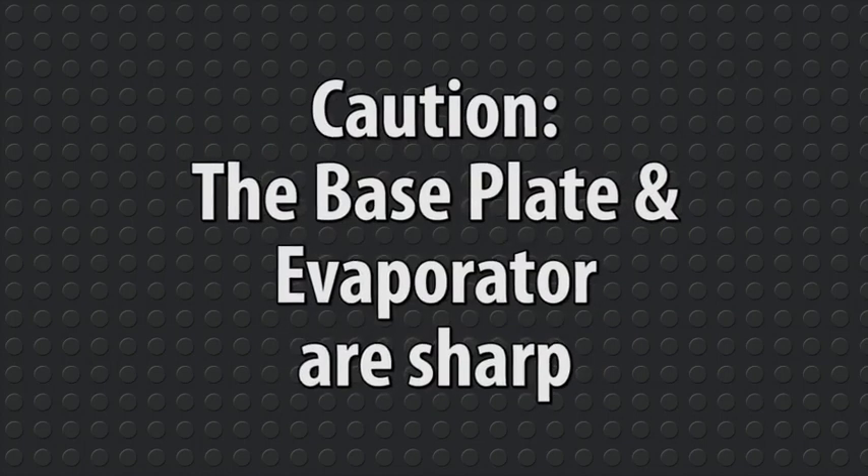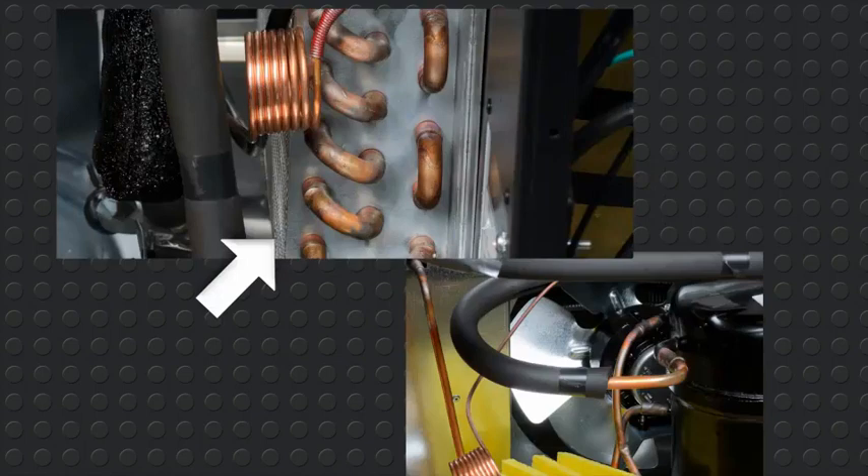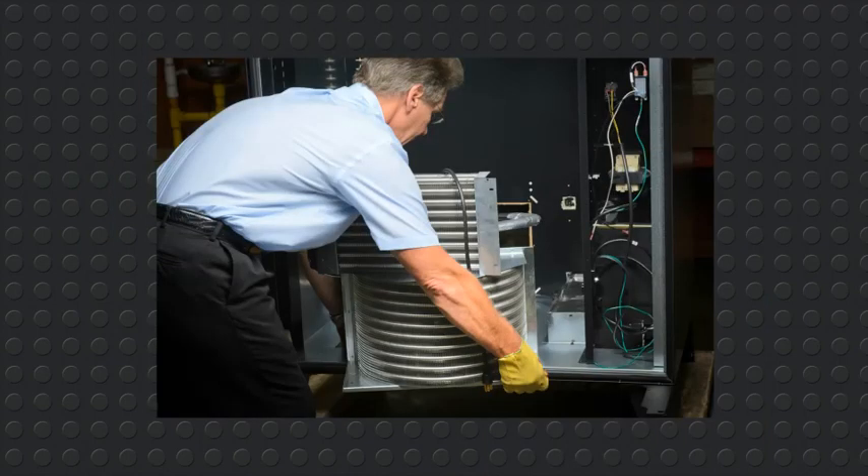Caution! Both the base plate and the evaporator are sharp. Do not grab any copper tubes. Breaking the copper tubes will cause refrigeration to release and void your warranty. Grab the front right corner and the left rear corner and lift.